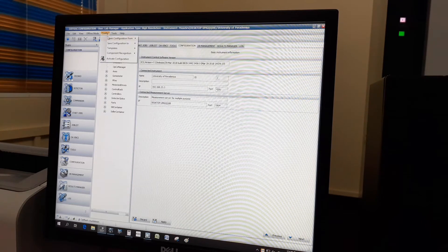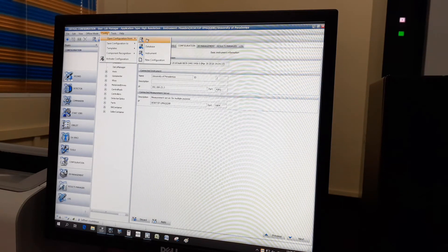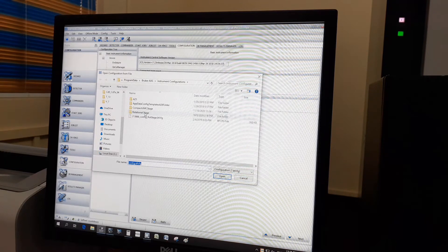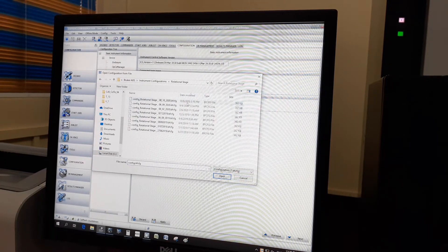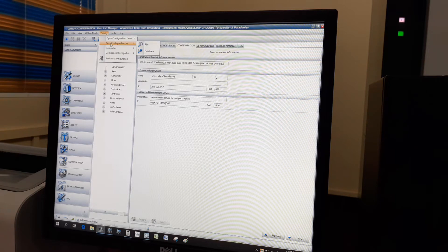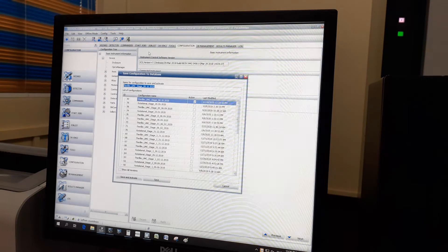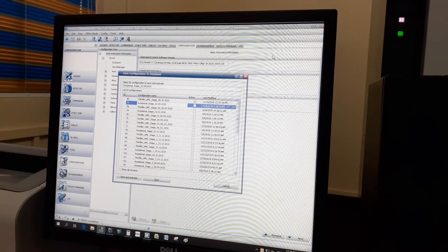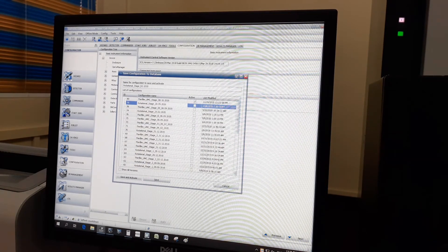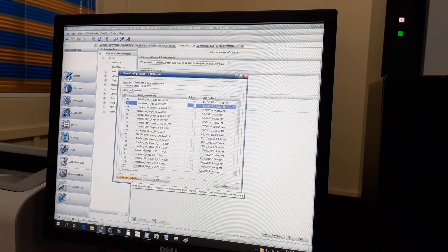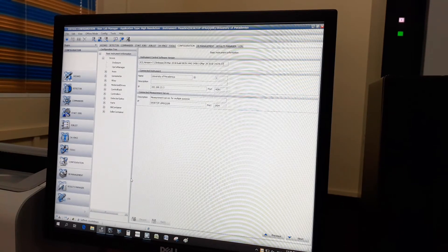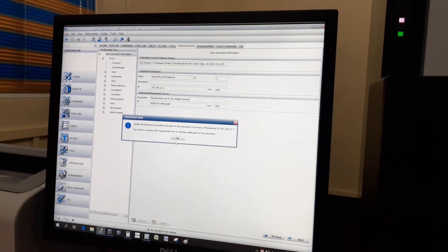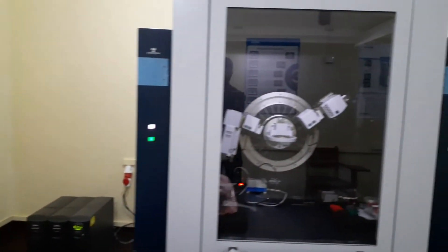Now it is time for the configuration. For that we can use a previously saved configuration file. After selecting the proper configuration file, we can send that configuration to the XRD machine. Once we send the configuration to the XRD machine, it will be restarted.